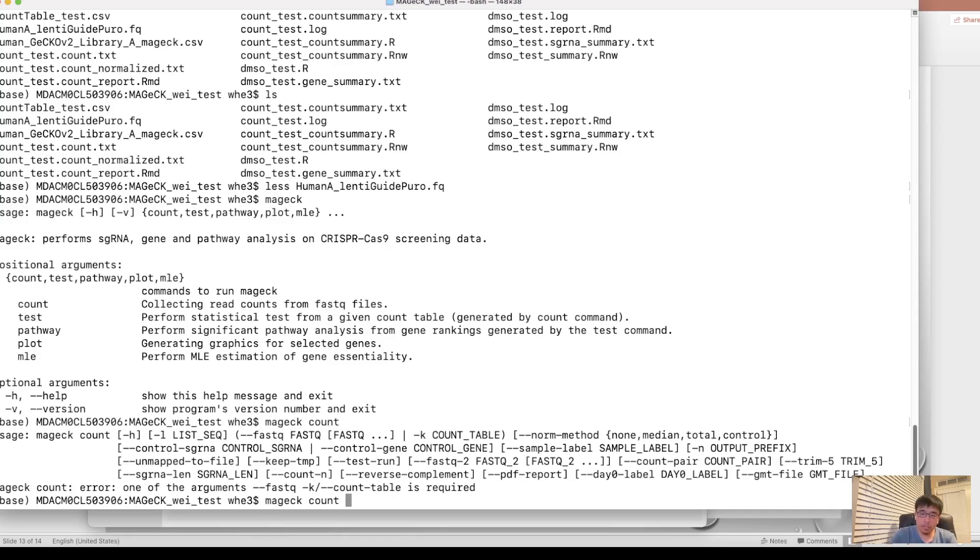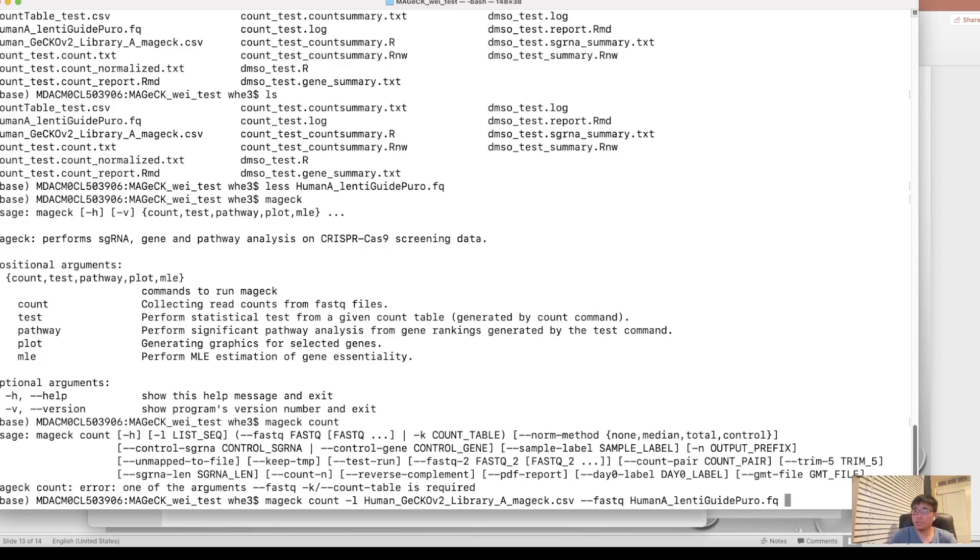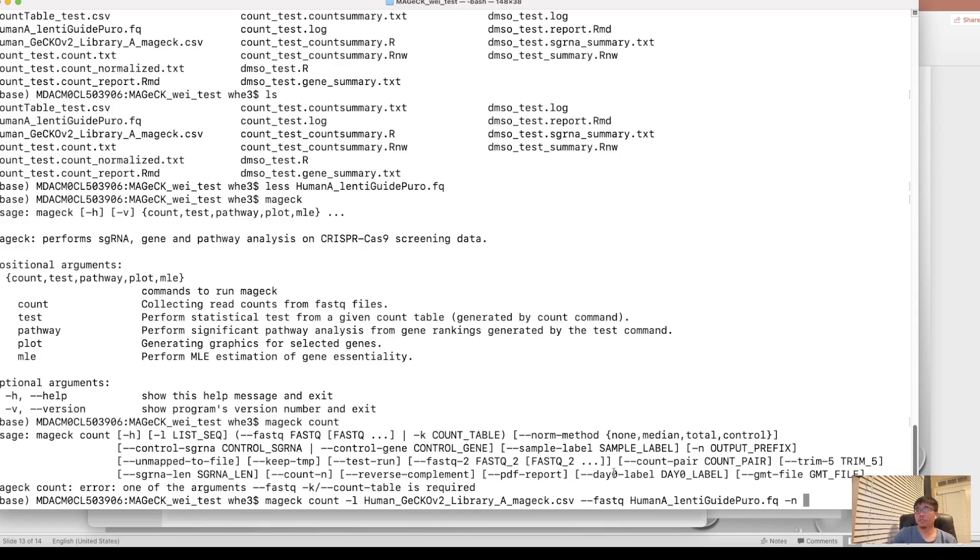First we need the L. So it's a library. So our library is this one, right? Let's copy it. And another is fastq. The fastq file is the one at human. It's fastq file. And maybe we need also parameter n is here. The n means the prefix of the file generated. You can name it by yourself, like count.test.